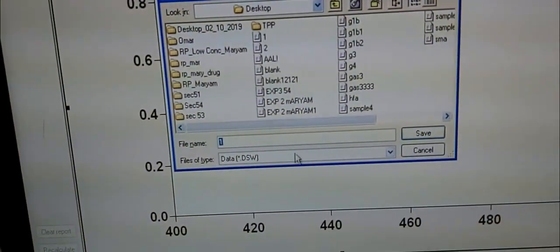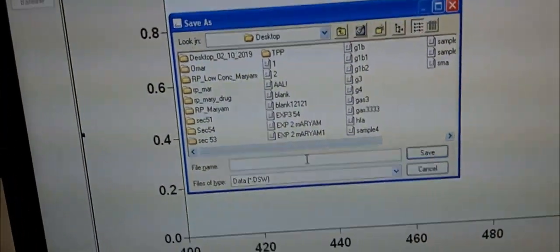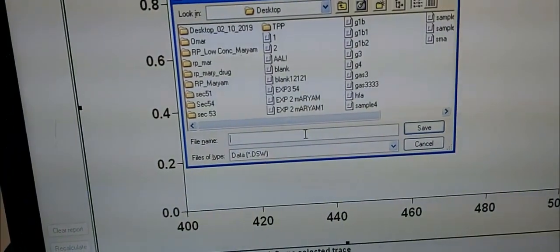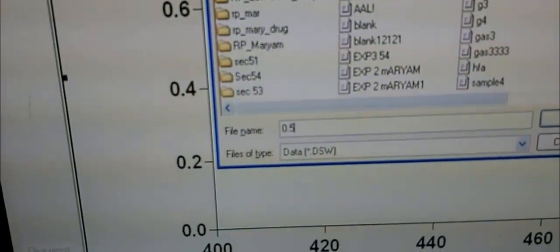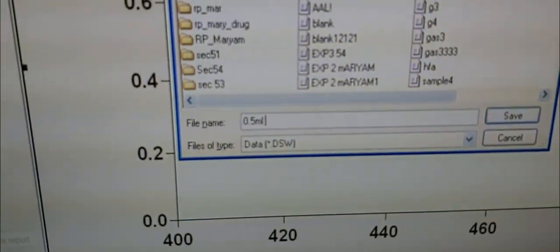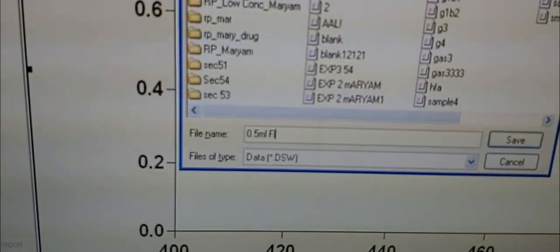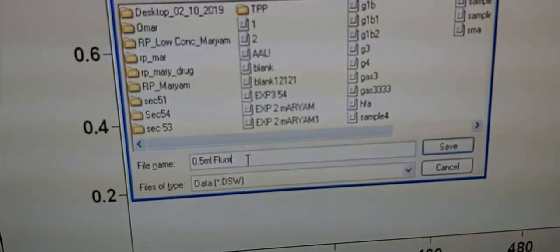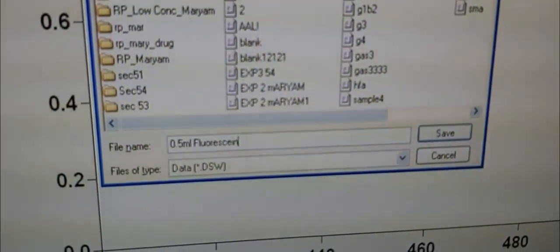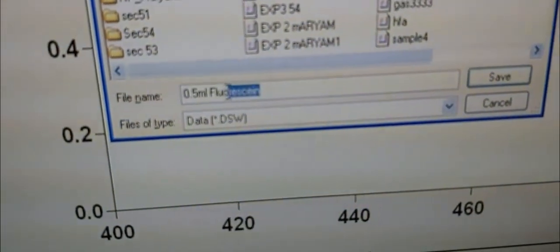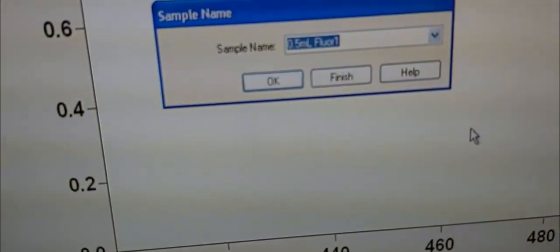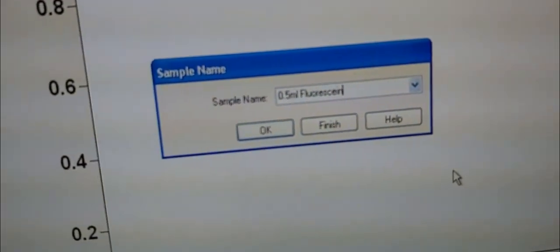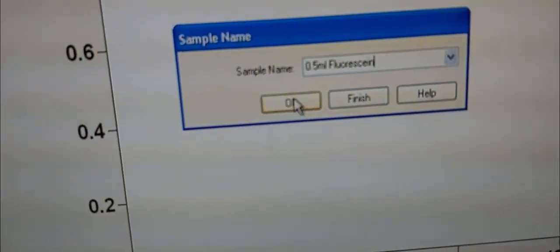We click 'Start' and it will ask us for a name. We put the name — for example, '0.5 mL fluorescein'. I select the name because it will ask me again to confirm. I click 'Save', put in the file name, and click 'OK'. Then in a few seconds the spectra will appear on the screen.